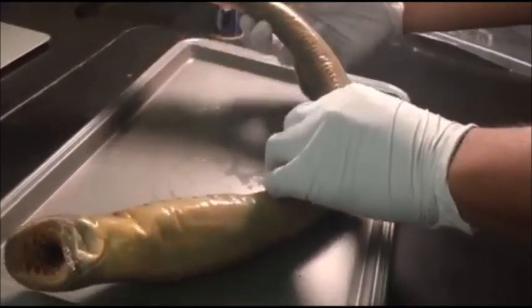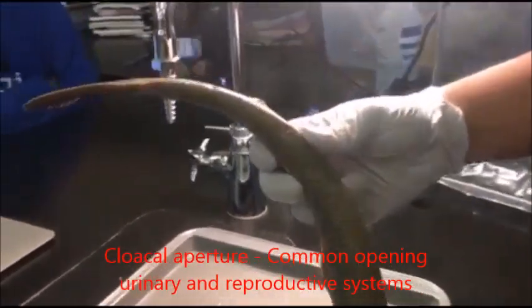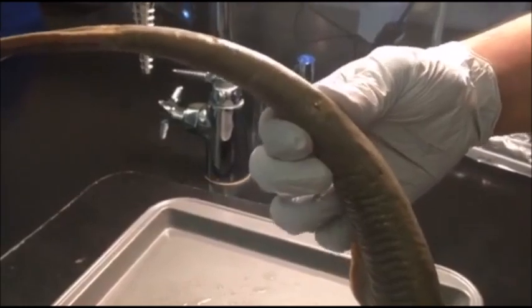There is the cloaca aperture, which is basically an opening of the urinary and reproductive system — so it's basically the genitals for this creature.